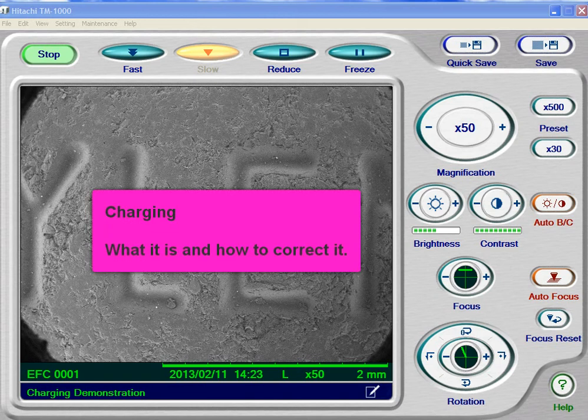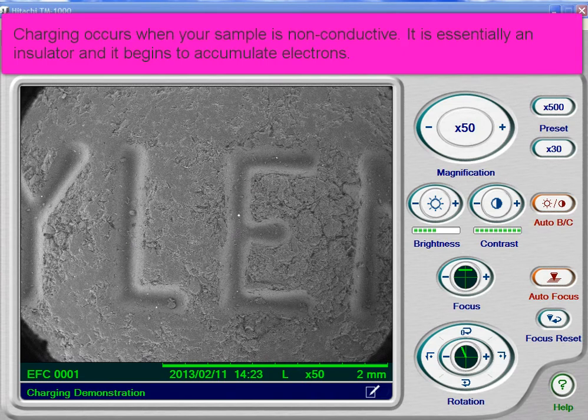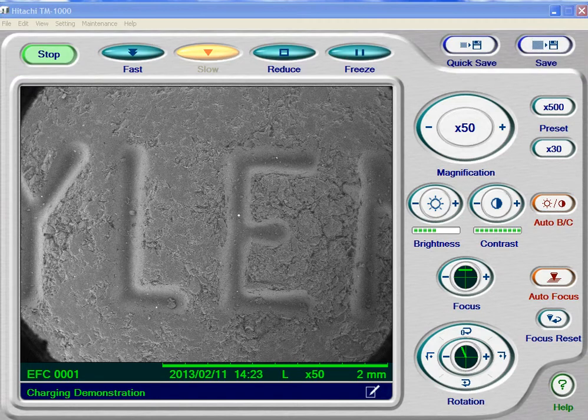We're going to use the TM-1000 right here to show you a phenomenon known as charging. This is what happens when you use a non-conductive sample. The electron gun gives off electrons, and we have a positive charge down on the stage to pull those electrons toward our specimen. But if the specimen doesn't conduct those electrons, it can actually become negatively charged, and the charge builds up. So, let's take a look at this.